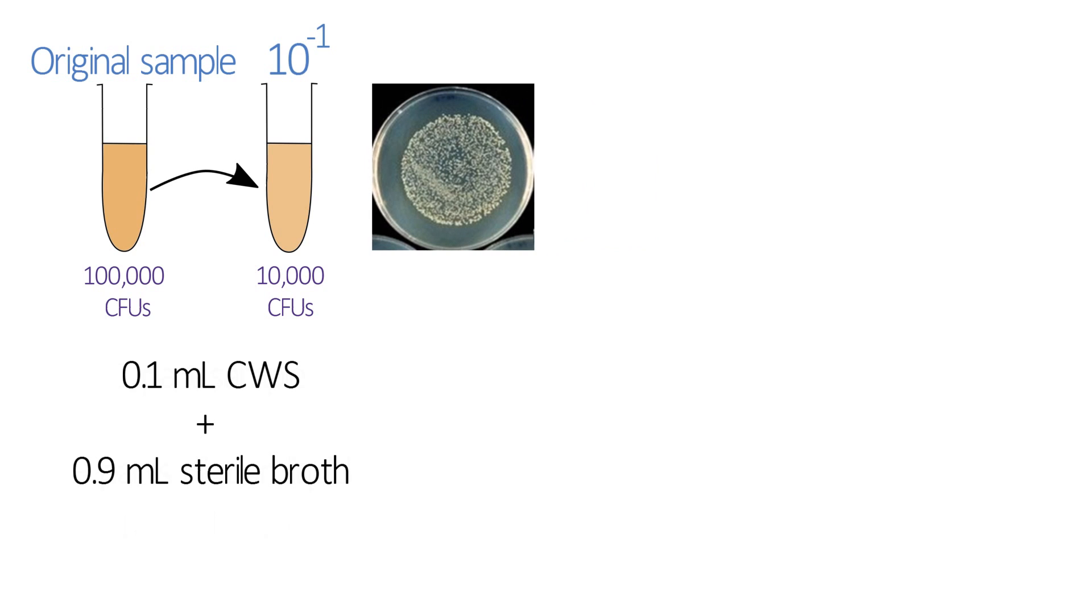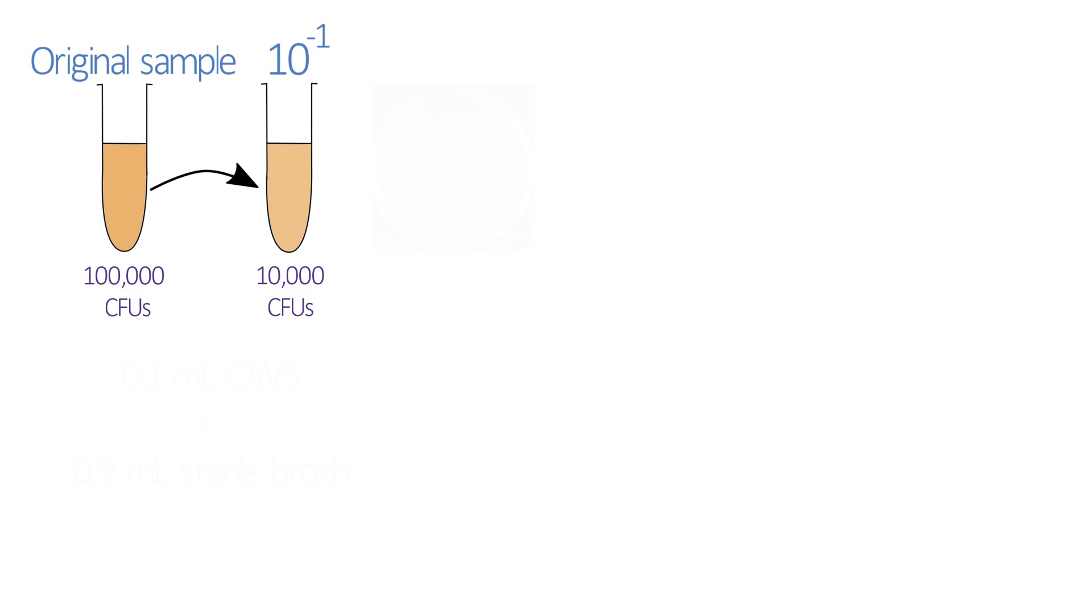However, if we plate this dilution out, we might still have too many colonies to count, so we're going to have to set up another dilution. The easiest way to do this is to do exactly the same thing again, but this time to dilute the ten to the minus one dilution by tenfold to give a ten to the minus two dilution.